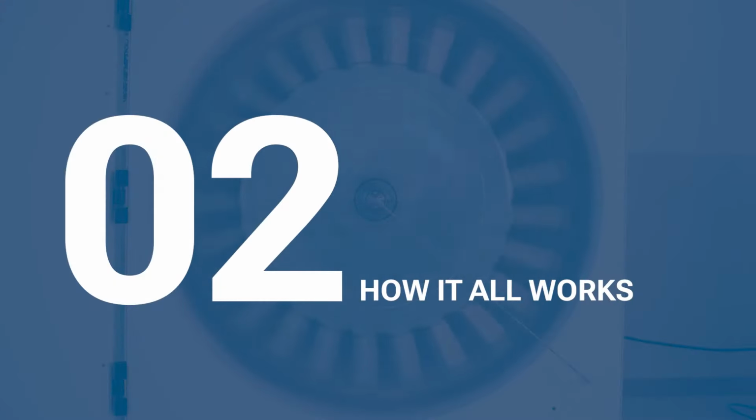In this step, compound B becomes the faster-moving one, reciprocal KD values govern their speeds, and we can collect pure compound B at the inlet of the rotor, while the co-elution band is pushed back. This cycle can be repeated until both compounds are fully separated using the CPC system. This technique allows us to effectively resolve compounds with very similar partition coefficients. Here's how it works.